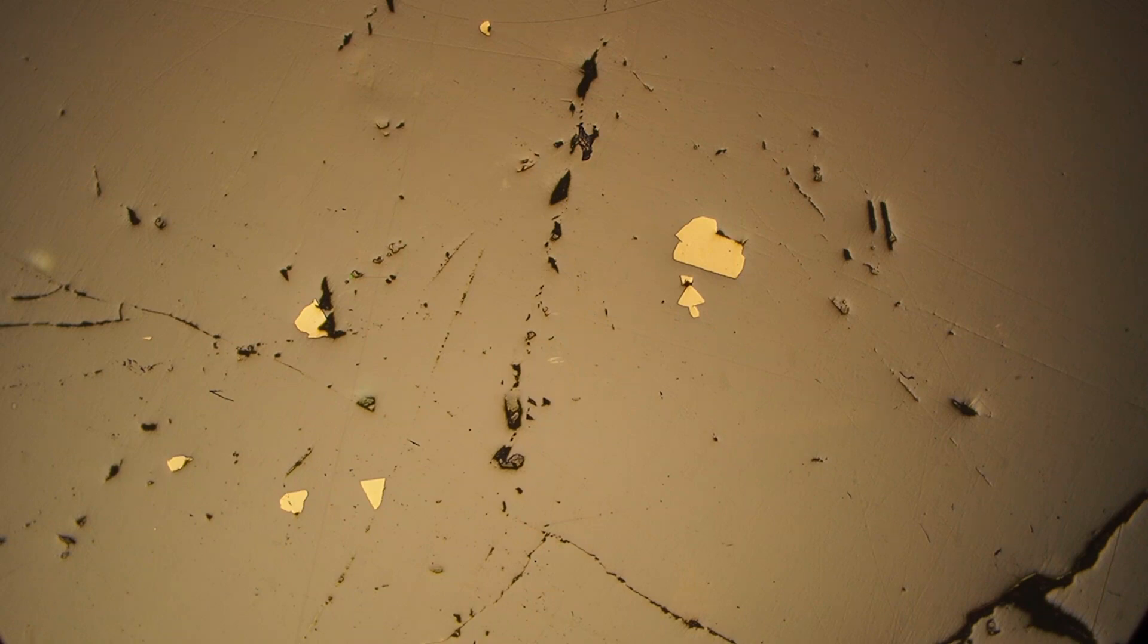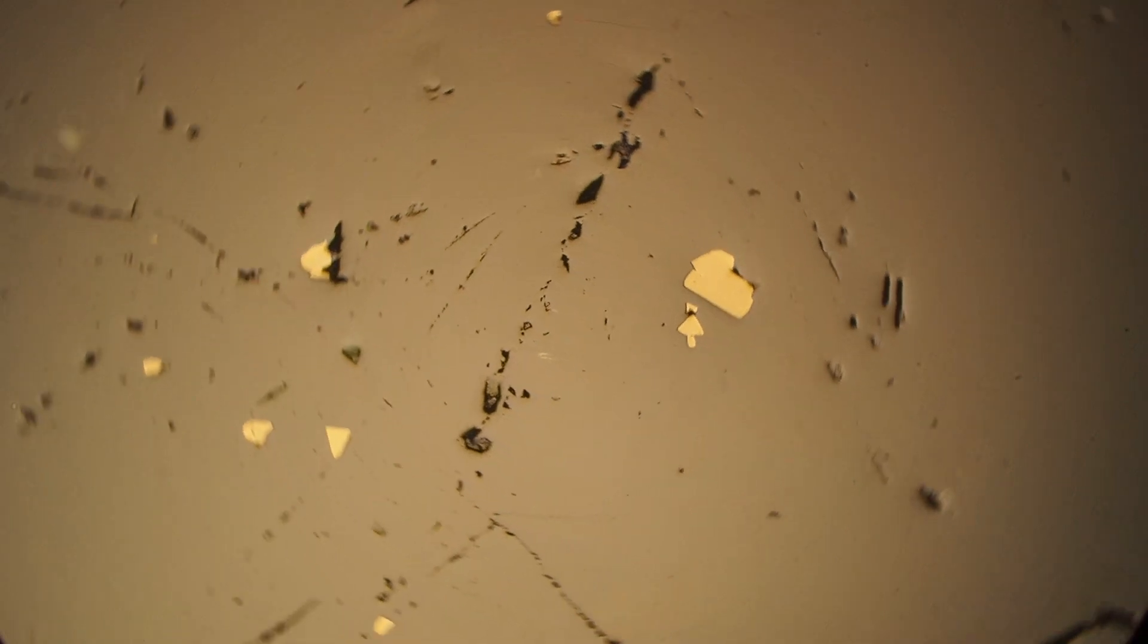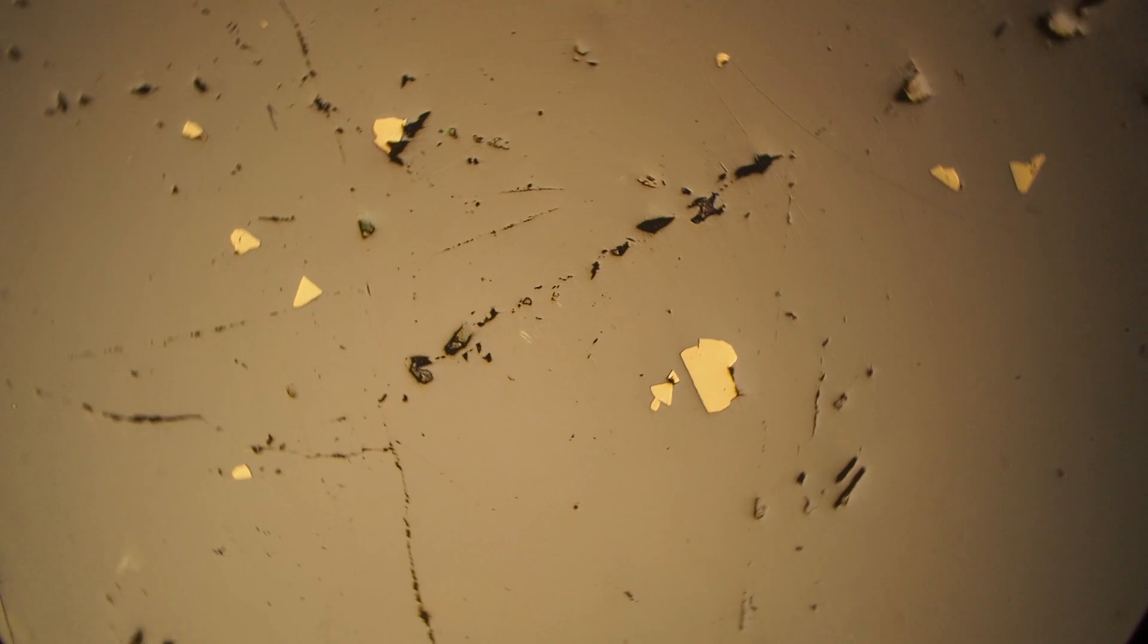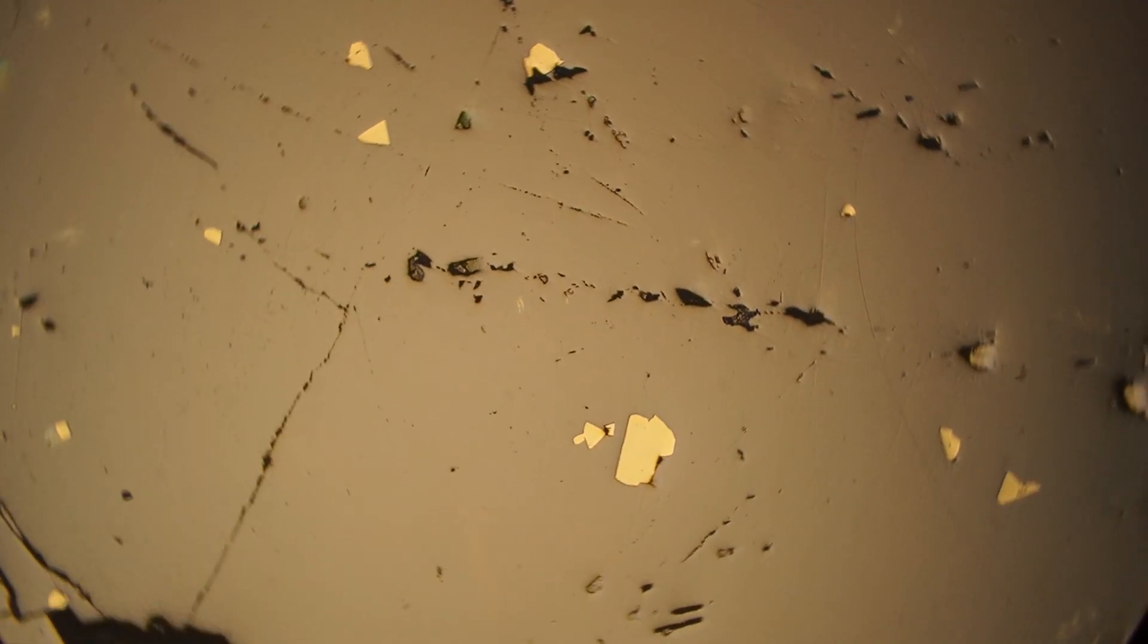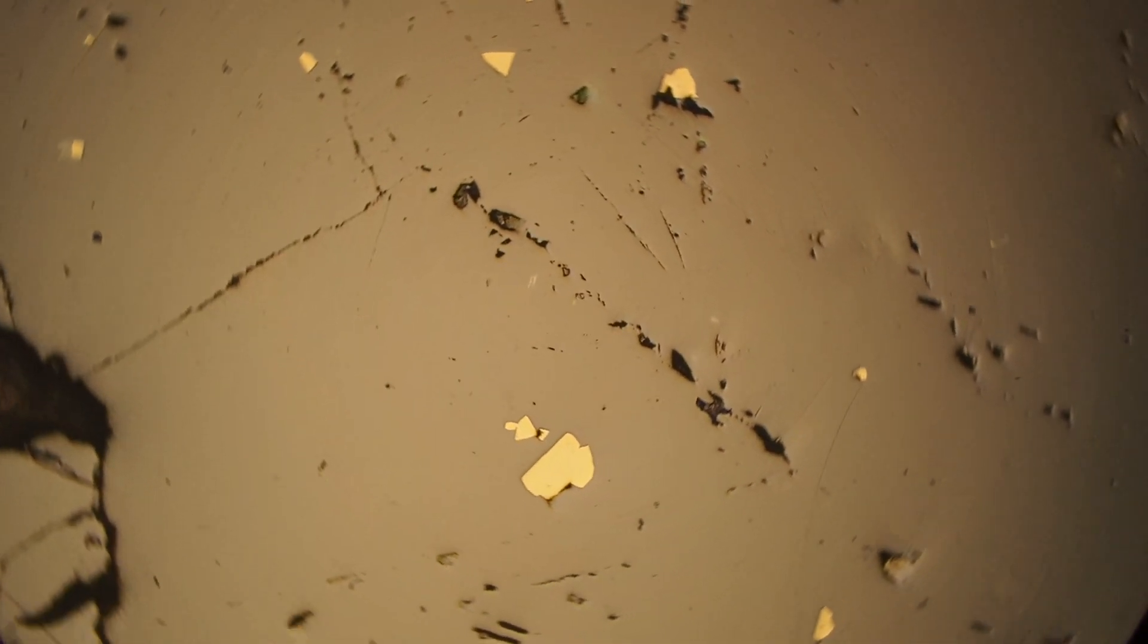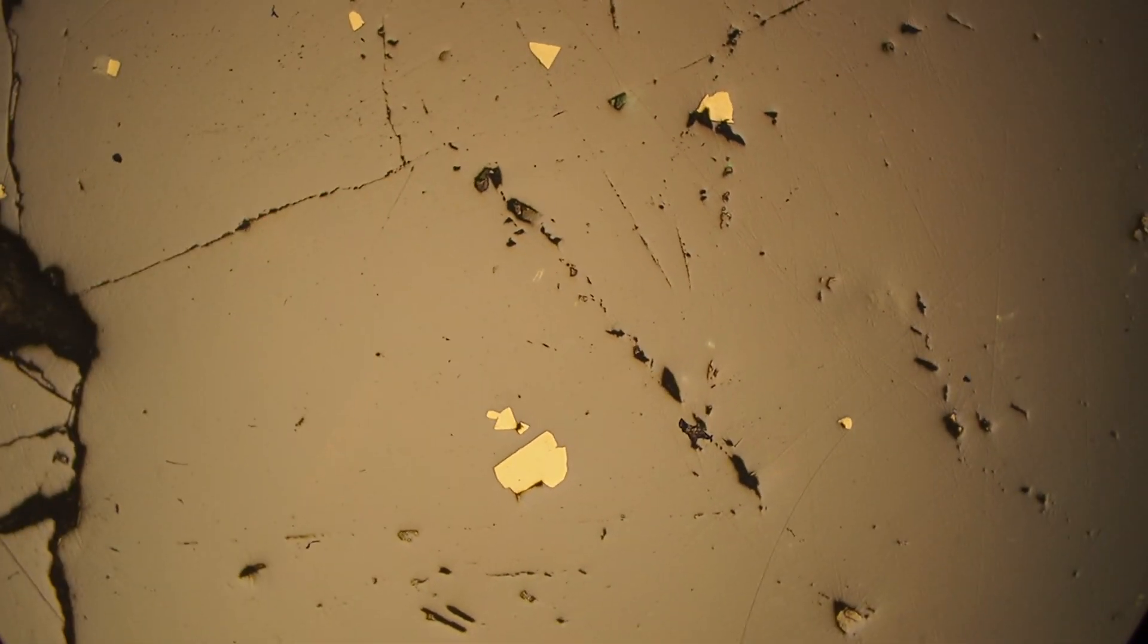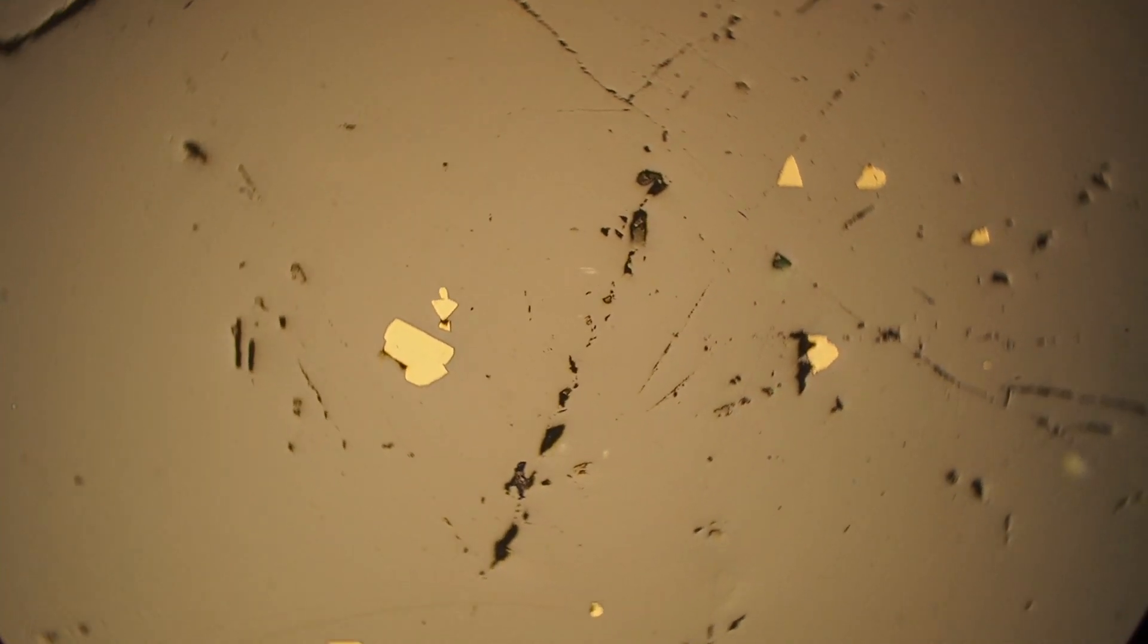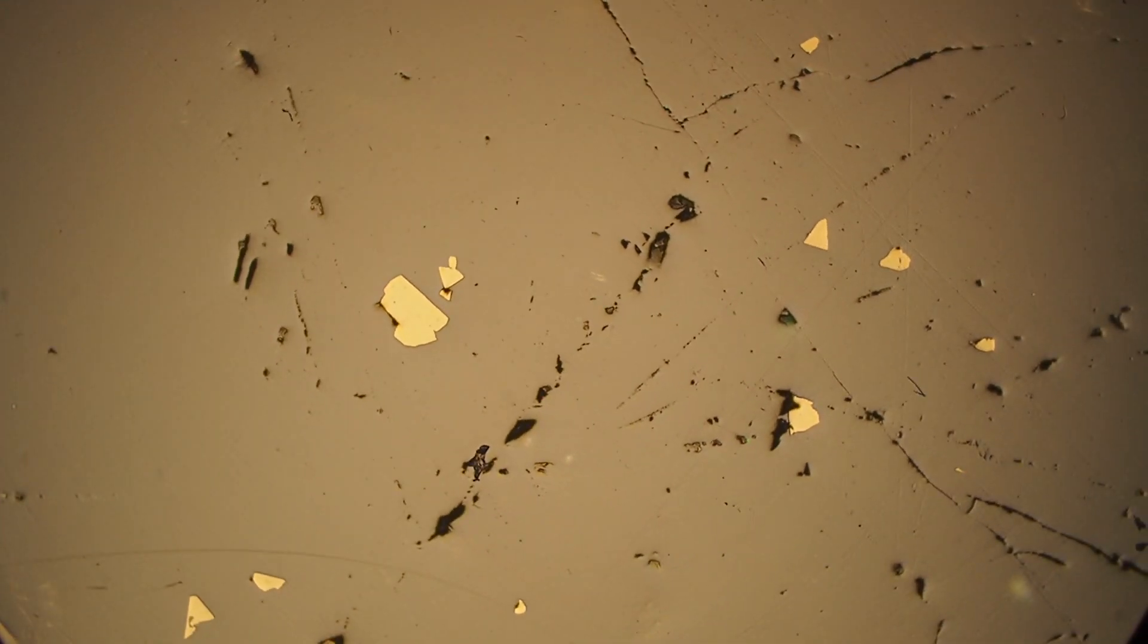Sphalerite is usually this medium gray color. As you can see as we rotate the stage, there's no change in color or brightness, so sphalerite is not bireflectant.